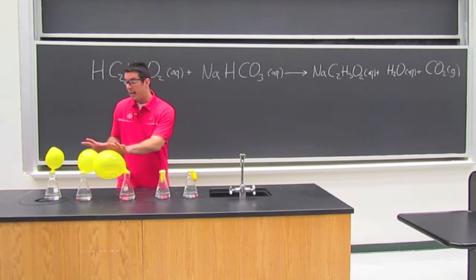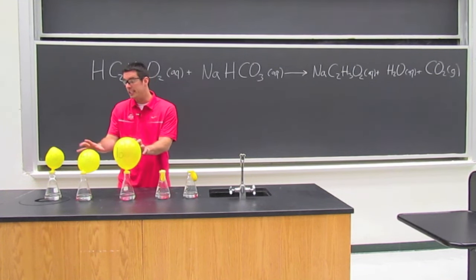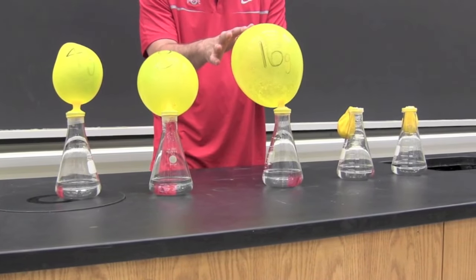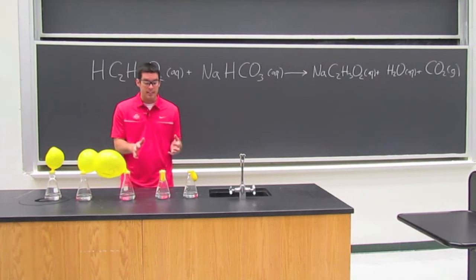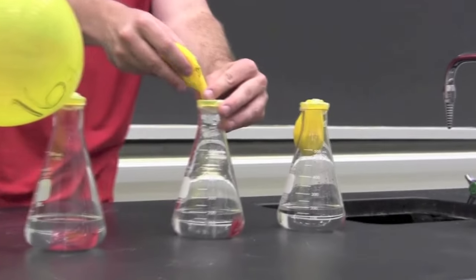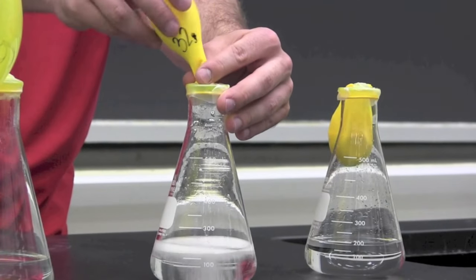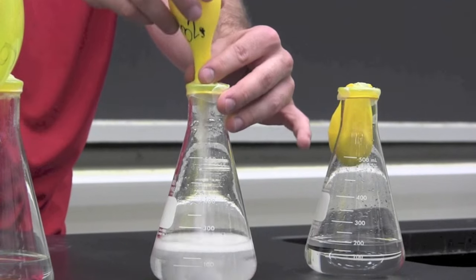So we just saw that as we went from 4 to 8 to 16 grams of sodium bicarbonate, each of the balloons got progressively bigger. Now let's take a look at the same reaction with 32 and 64 grams of sodium bicarbonate and see what happens to the relative amount of gas that's produced or the size of the balloon.